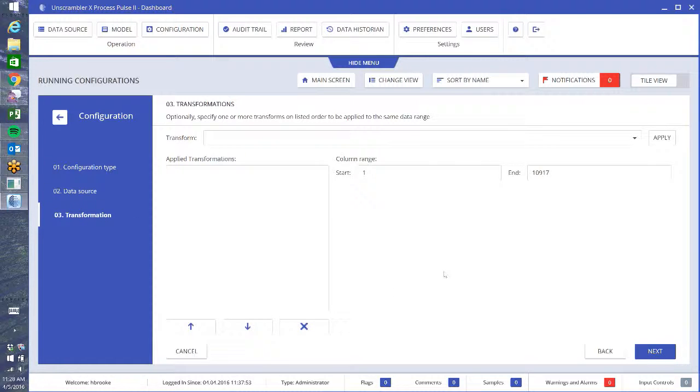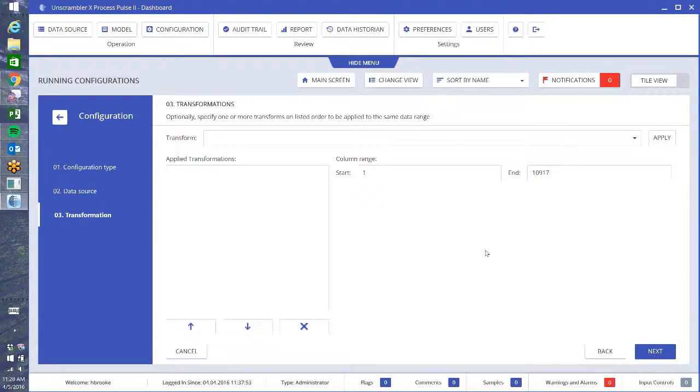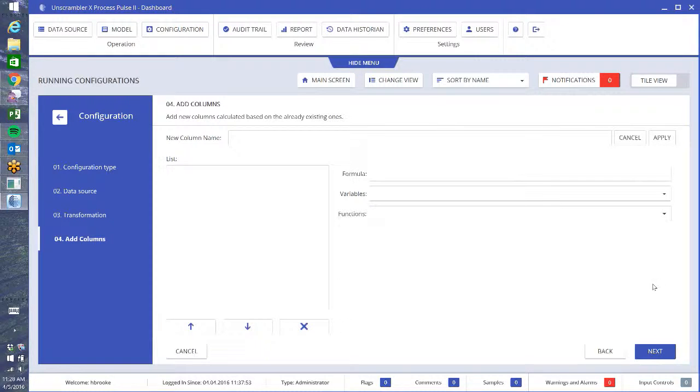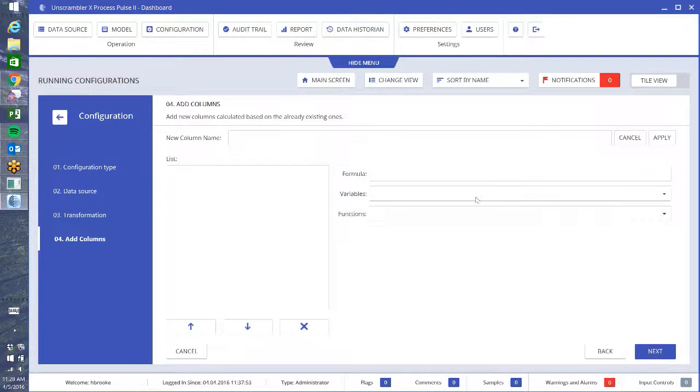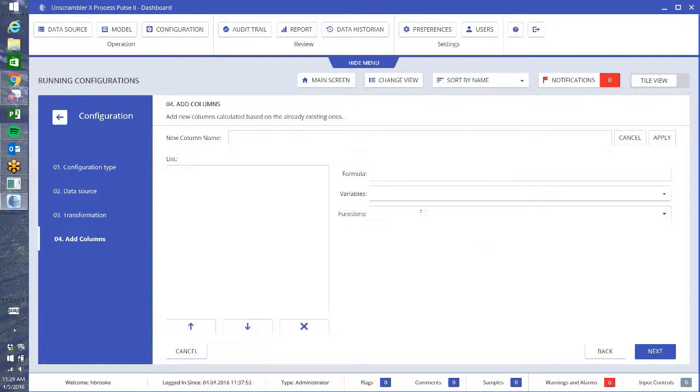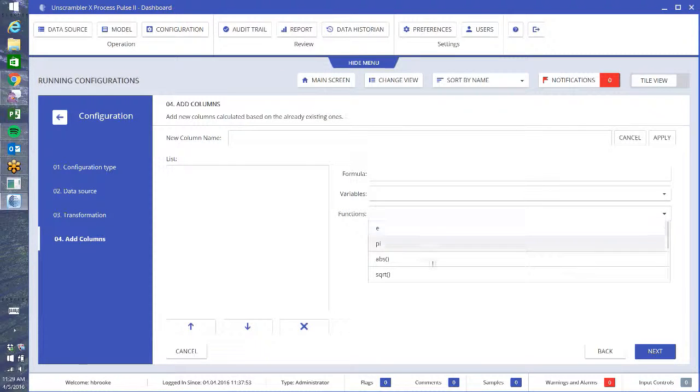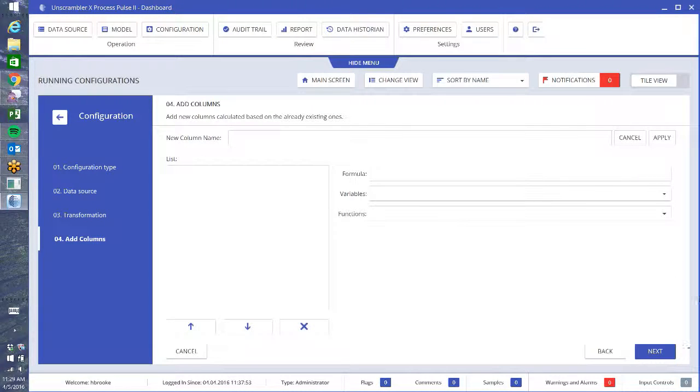Next, this is if you want to do any transformations that were already associated with the model. There's a drop down box and you have different ones that you can use like baseline, normalize, smoothing, very simple transforms. I'm not going to apply any and say next. I can create new columns as well based on formulas for my variables that are in my data source, and there are a number of different functions. You can build an equation with the different variables that are in that data source. I'm not going to do anything with that now and click next.